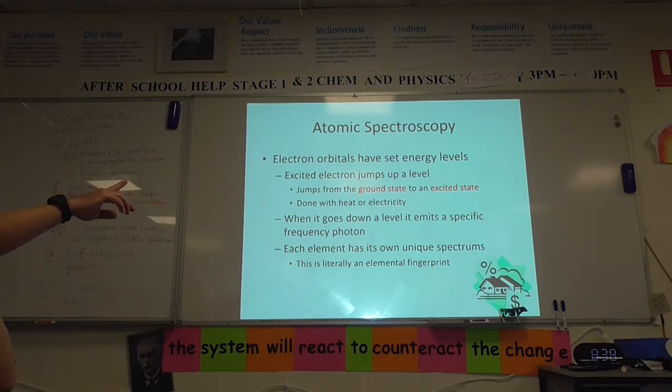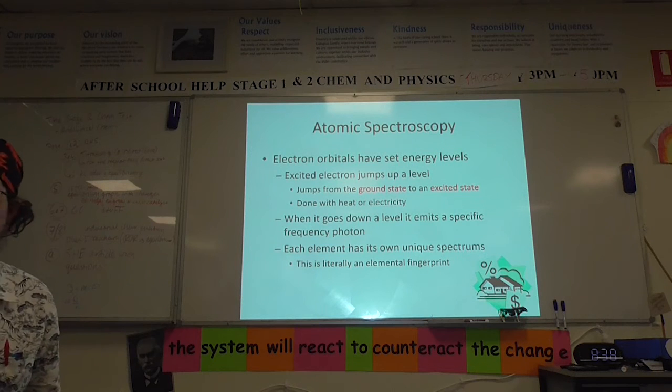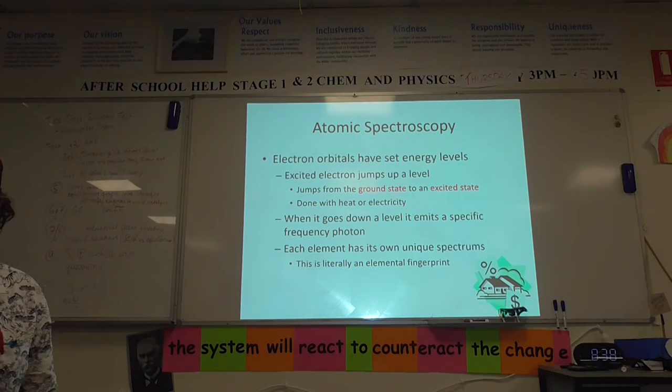The tubes in that light there are emitting light because you can see it, because there's electricity going across the tube. But that's emitting, isn't it? That's not absorbing. The rungs on the ladder are the same for emission and for absorption. So what we're talking about is actually absorbing light of the same wavelength.